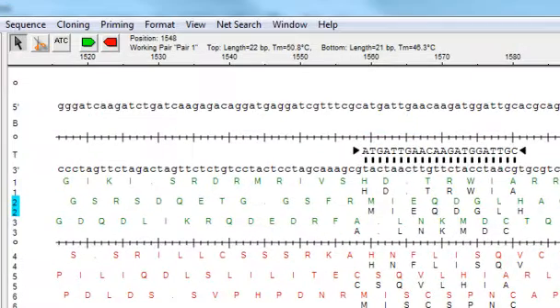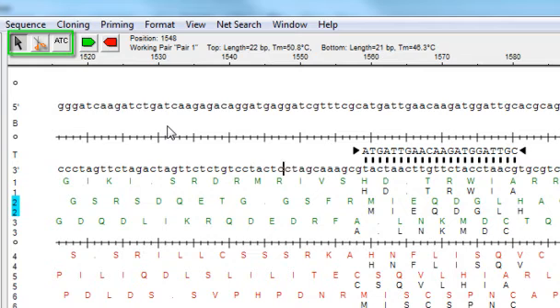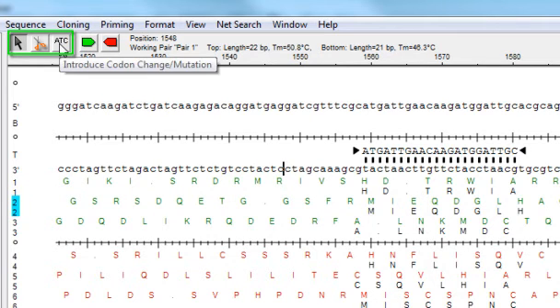From the top pane here, you can introduce a new restriction site or introduce a codon change or mutation by using these tools up here at the top of the window.